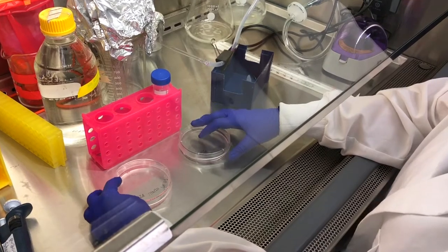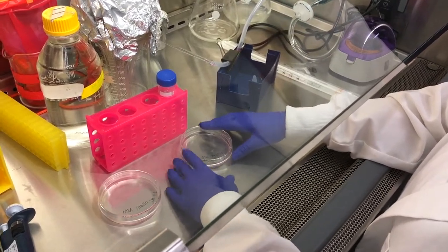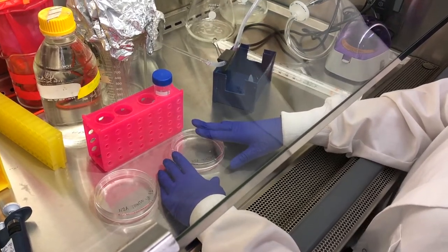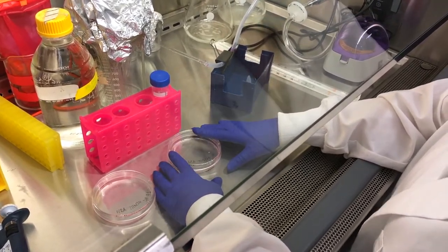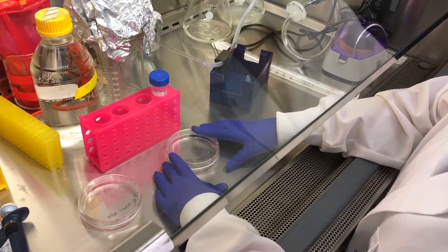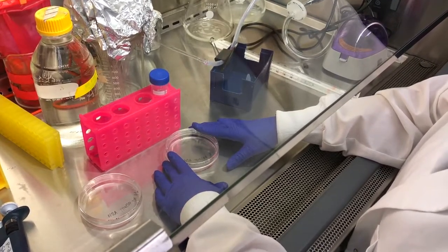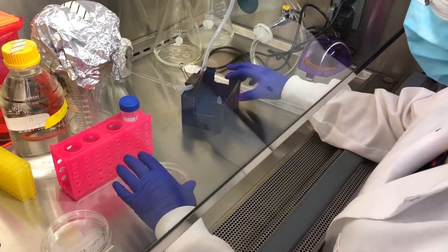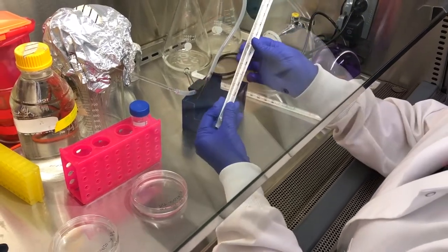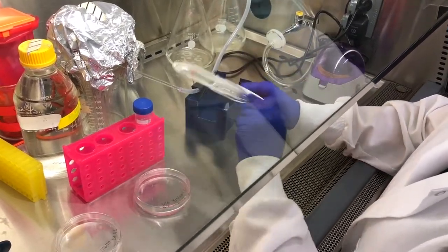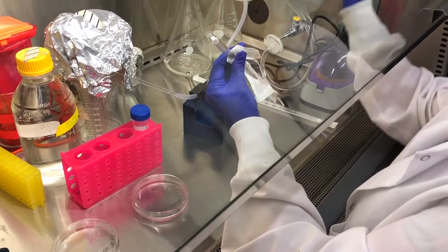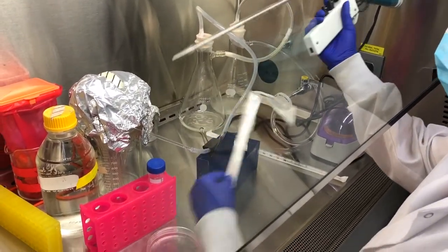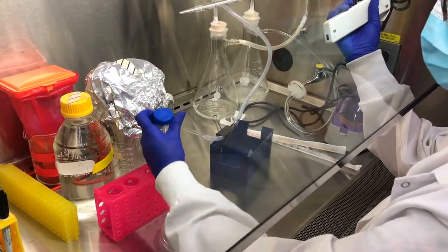So because we're doing a one to two split, this just means that we're going to take five mils of our re-suspended cells and add them to a new plate with five mils of fresh media. So going back here, we have our cells that are adhered to the bottom of our original plate. I'm just going to go ahead and re-suspend them with a new pipette. And I'm going to re-suspend them in 10 mils of fresh media.